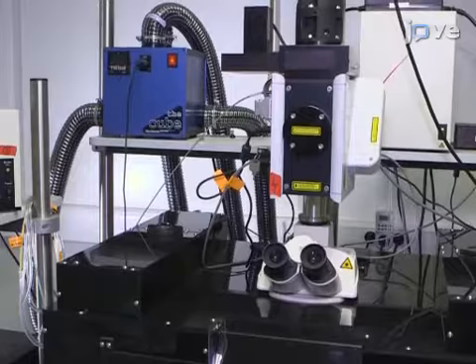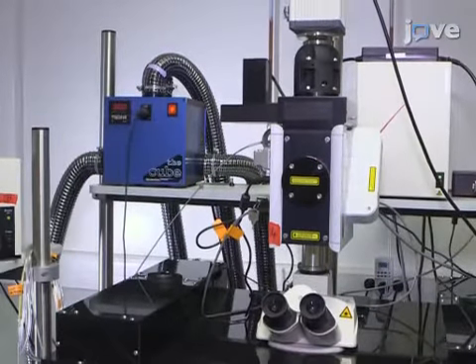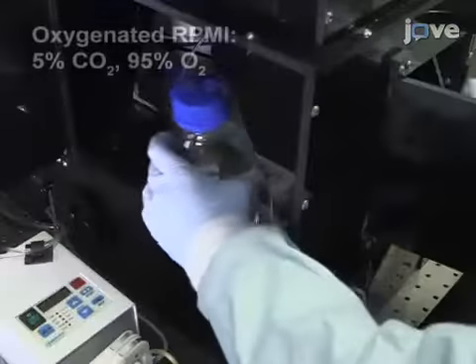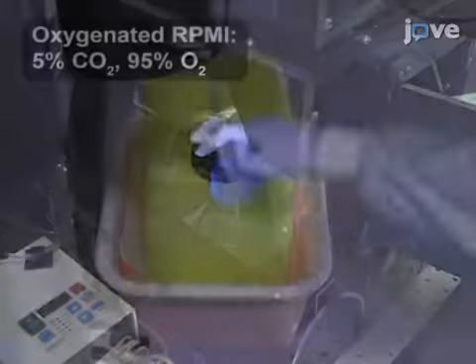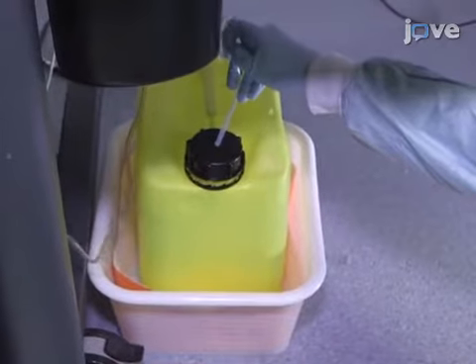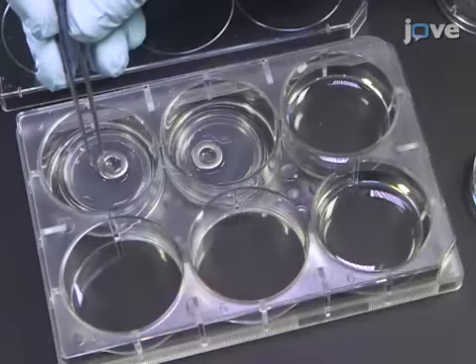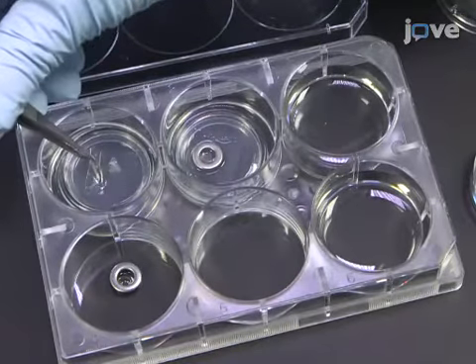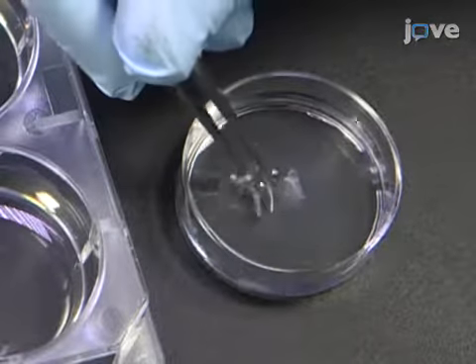Several hours prior to starting this experiment, set the temperature of the microscope heat chamber to 37 degrees Celsius. Then, prepare the microscope setup to constantly perfuse tumor slices with oxygenated phenol red-free RPMI medium and to aspirate the solution to a waste collection flask using a peristaltic pump. With the help of fine forceps, lift the stained slice out of the 6-well plate and transfer it to a 35 mm plastic dish filled with phenol red-free RPMI medium.